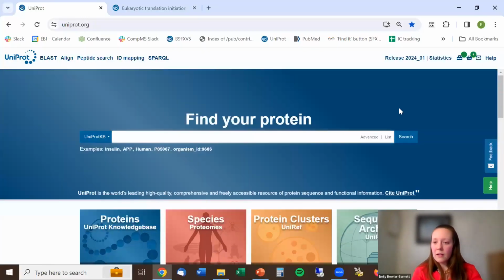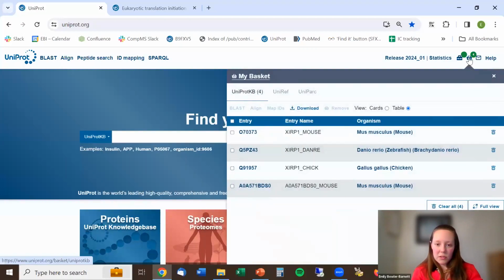I like doing this. Just move that box out of the way. Do I have two interesting queries? Here we go. Oh, look. One I did earlier.